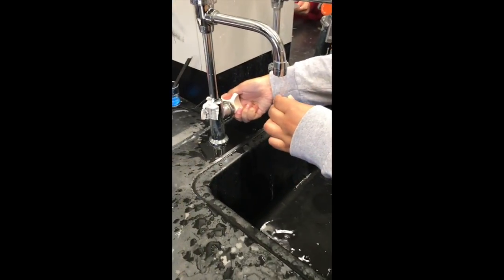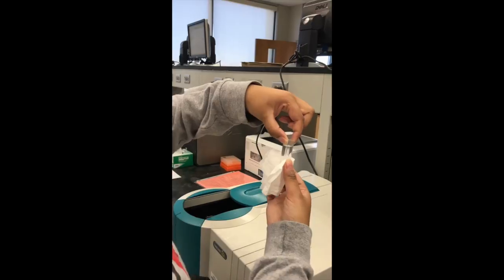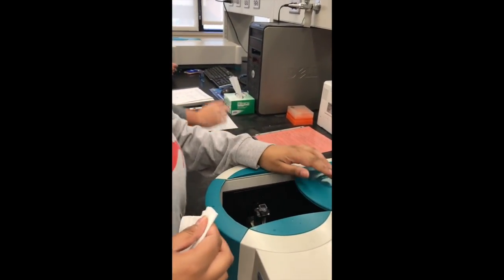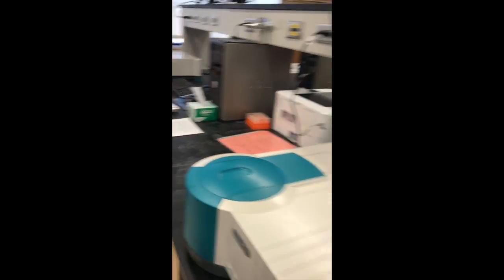Use deionized water for the blank. Clearly wipe 2 sides of the cuvette, of all cuvettes, before placing it into the spectrophotometer.